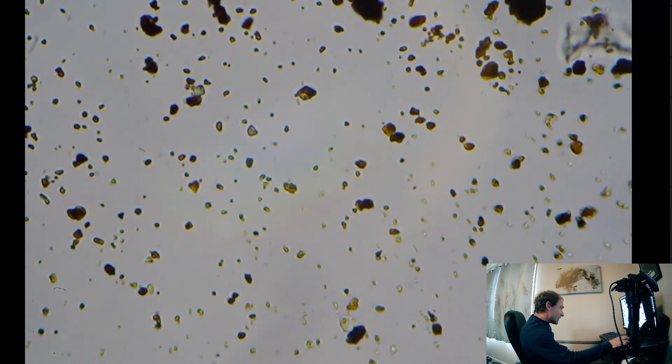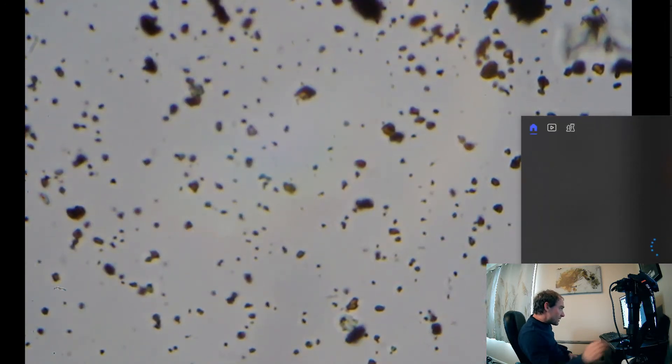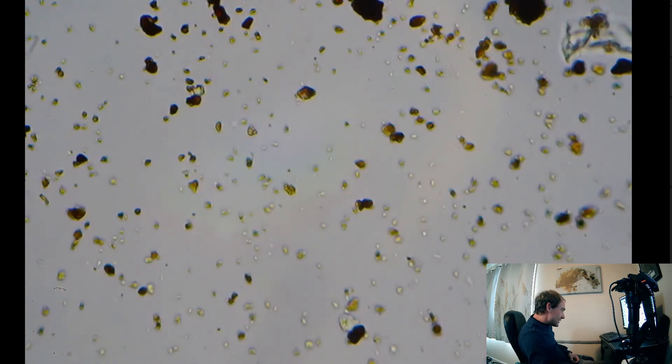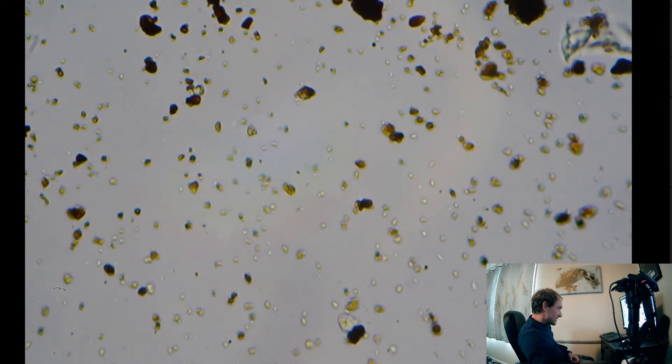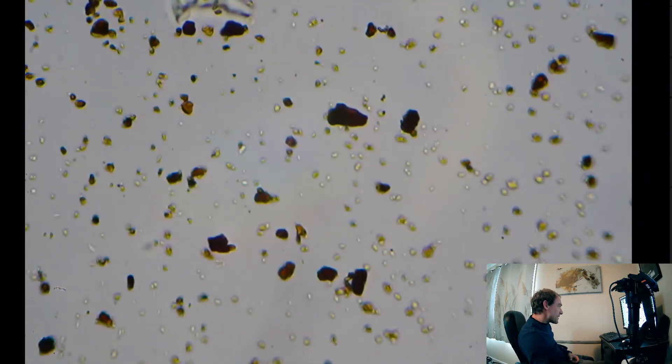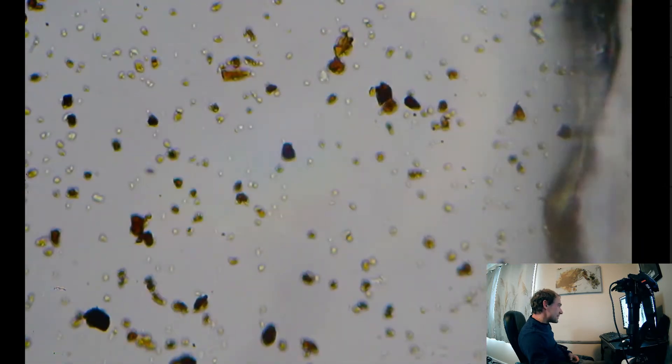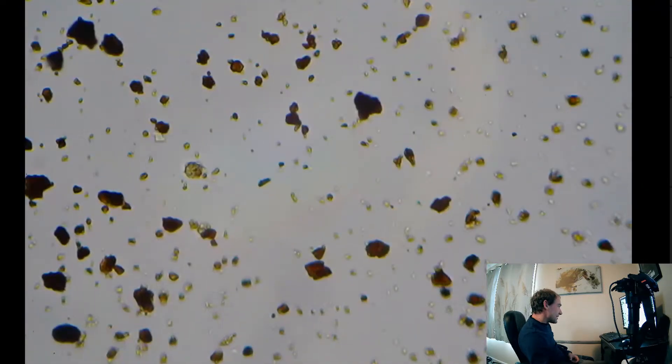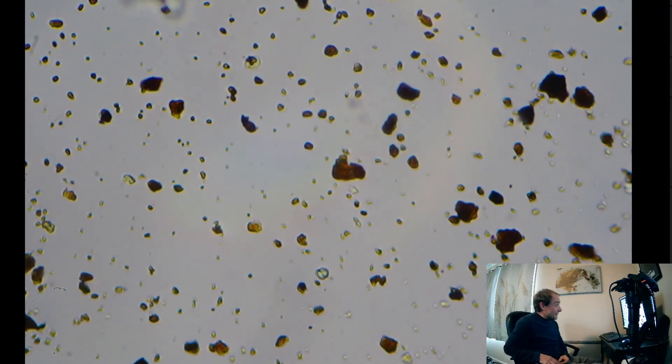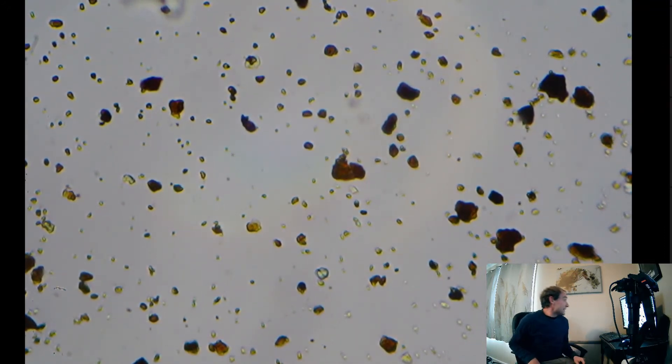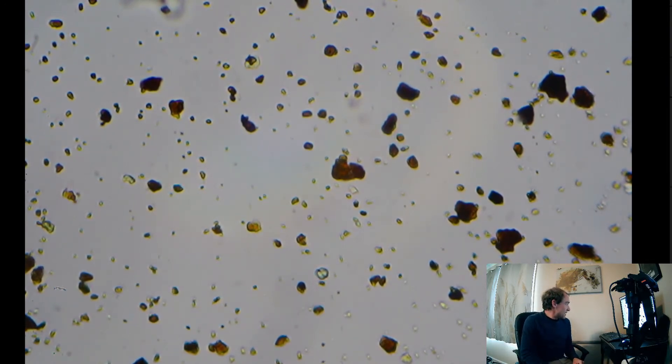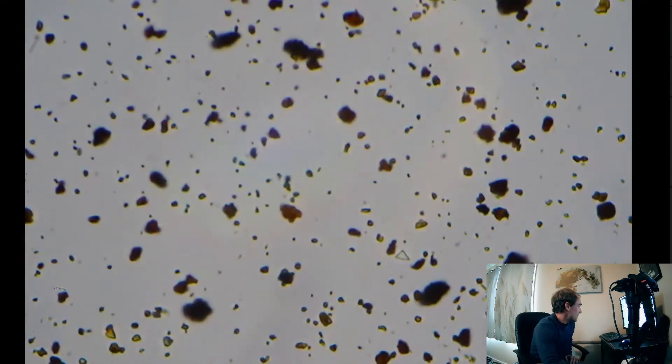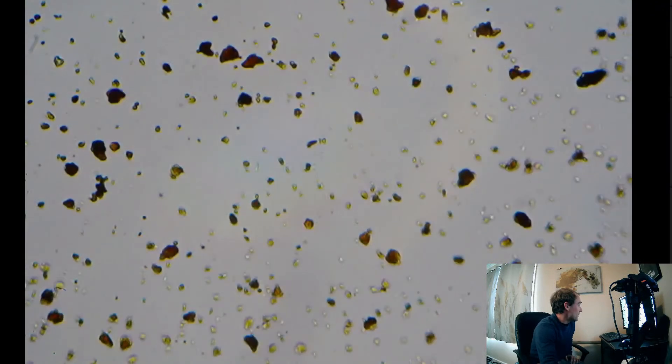There's a longer shape there. Yeah, it's still more of a bacillus, it's not quite a spirilla. And we're to the edge of the slide. Yeah, there's Rejuvenate for you. Most bacterial life we have seen out of any other product, but just a lot of bacteria. And yeah, even though it's supposed to be more of a food for the biology.